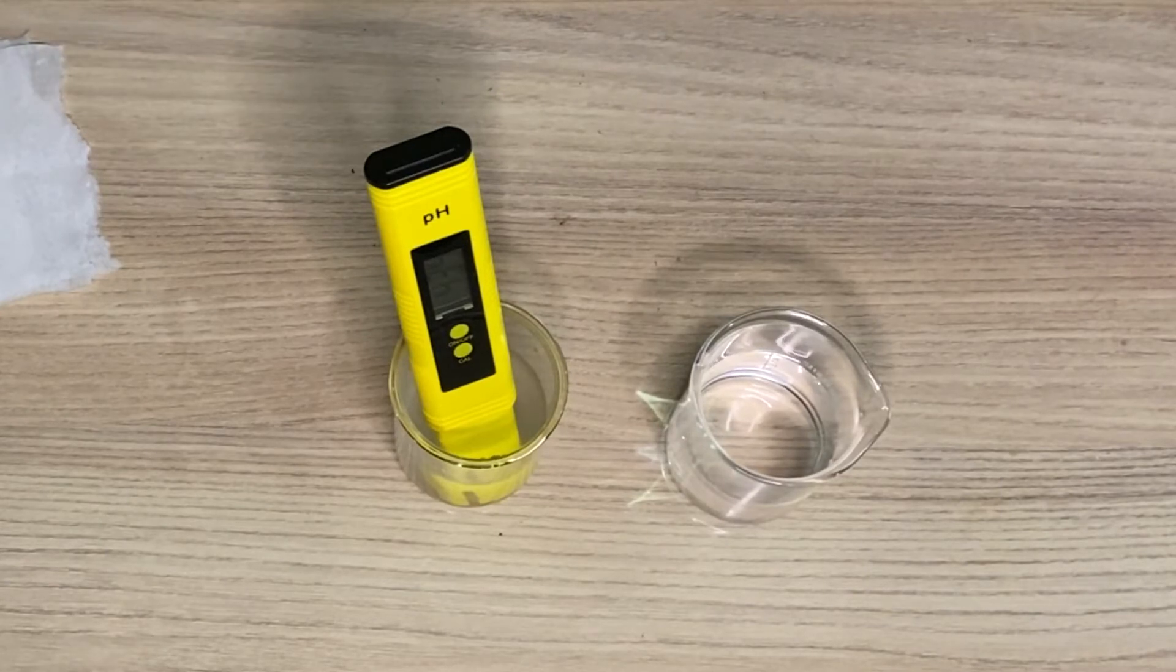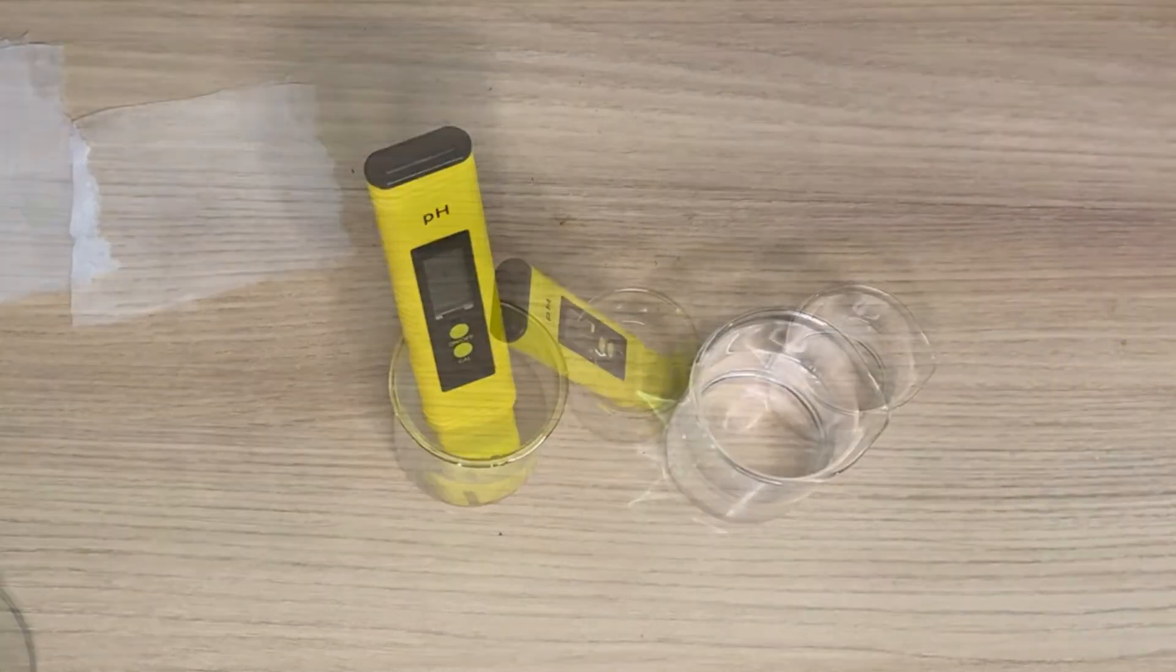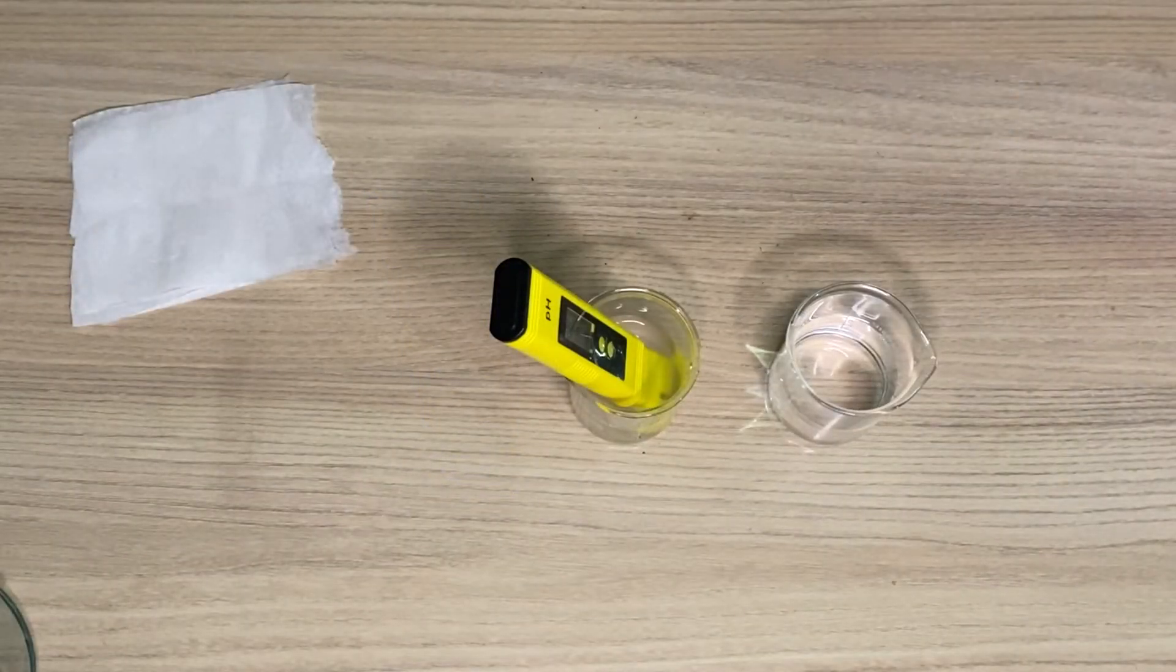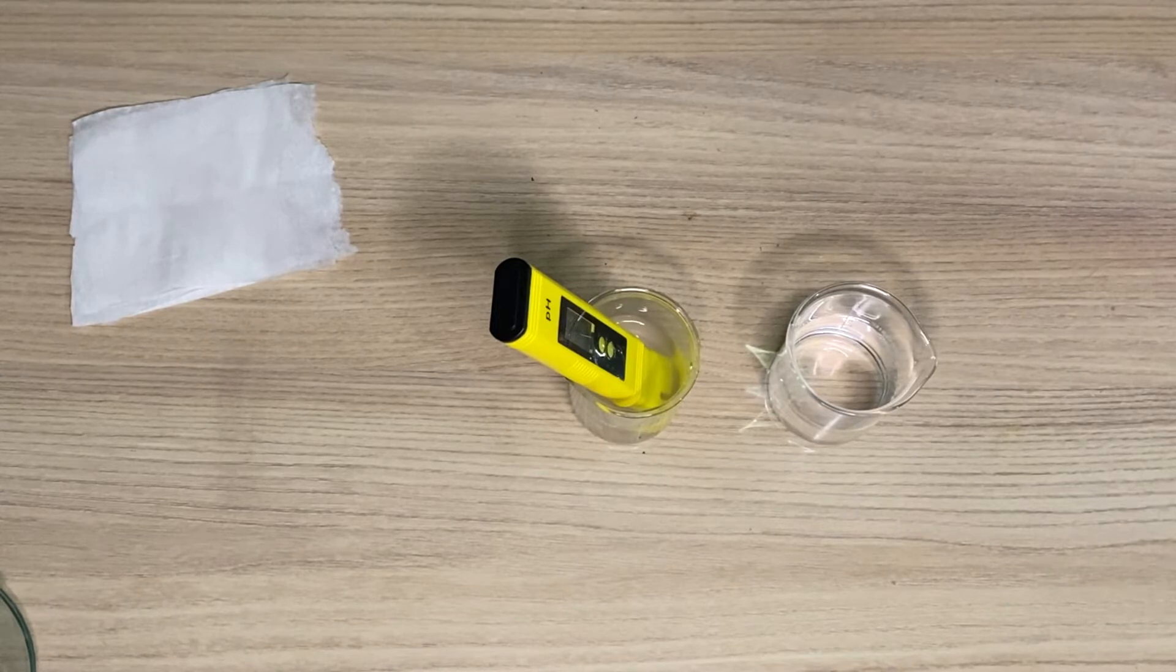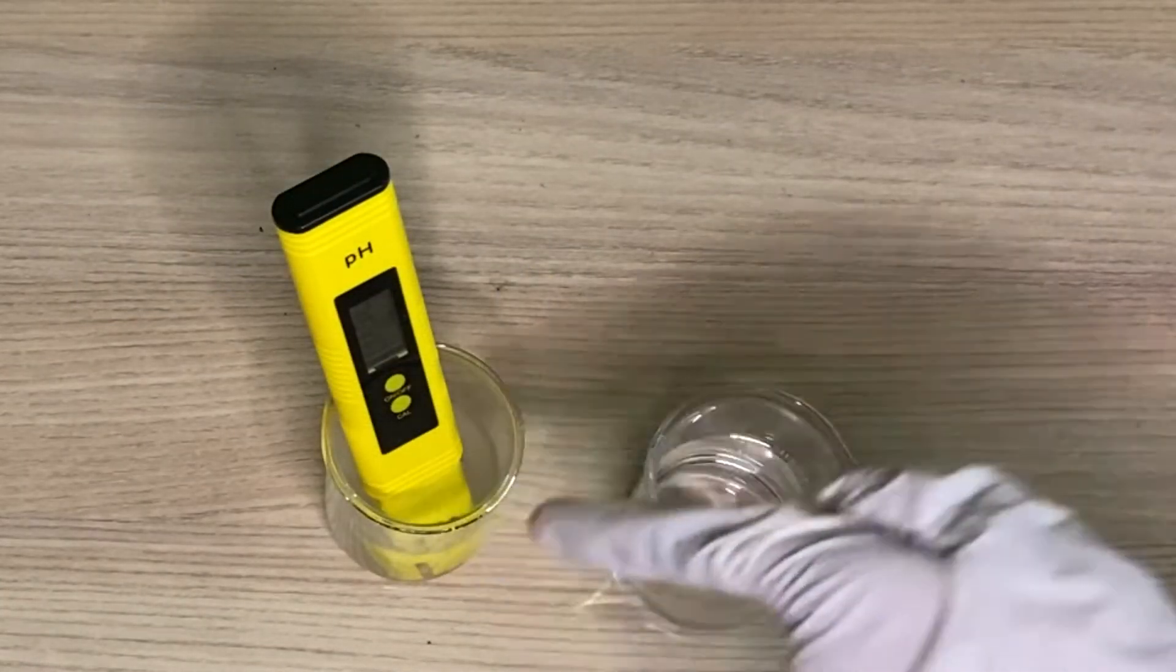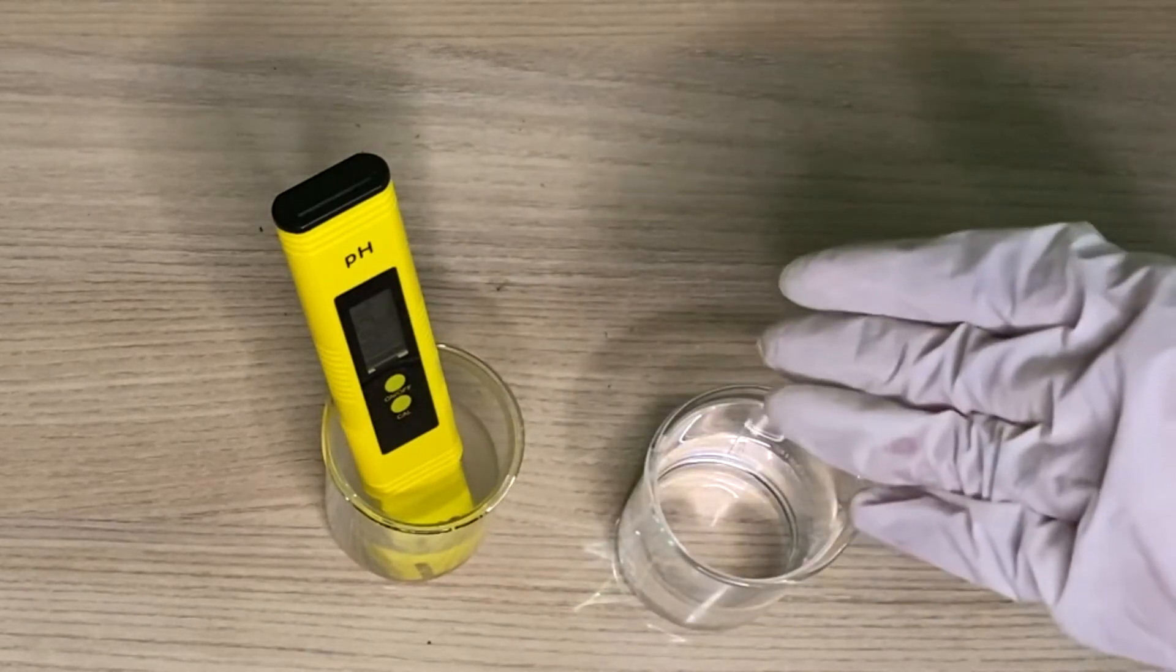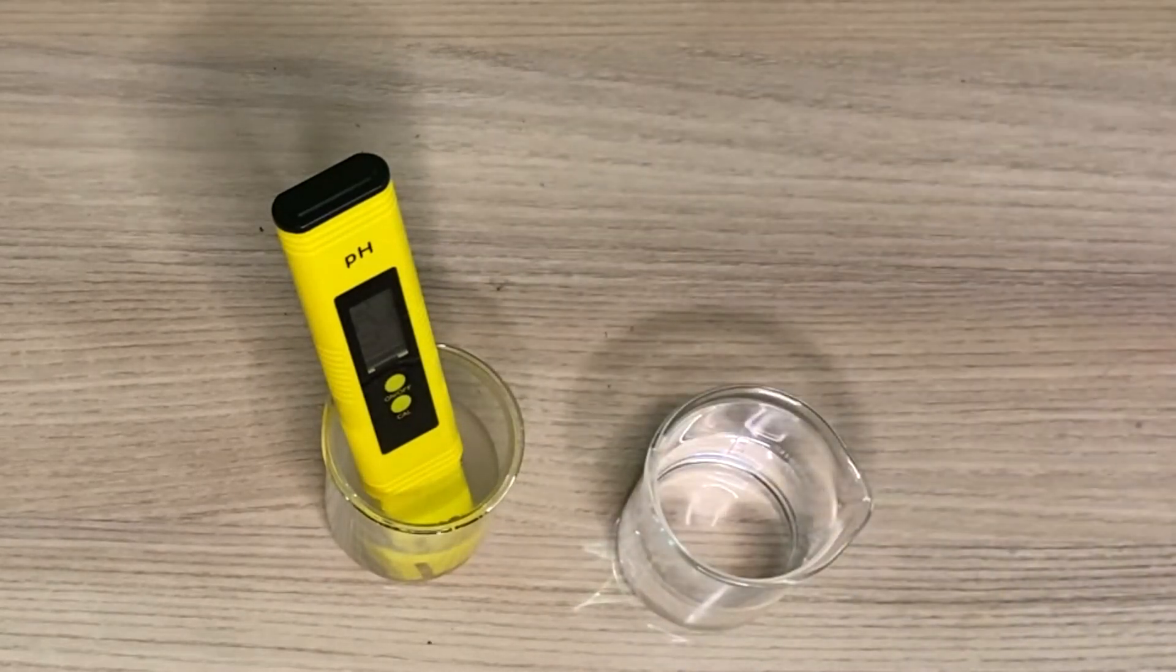It will be stable at a particular pH. That is the one which we need to note. Give it some 10 to 15 seconds. It will be stable at one point. Okay, do you see that the pH is now stable at 4.24? So this is the pH of the product.